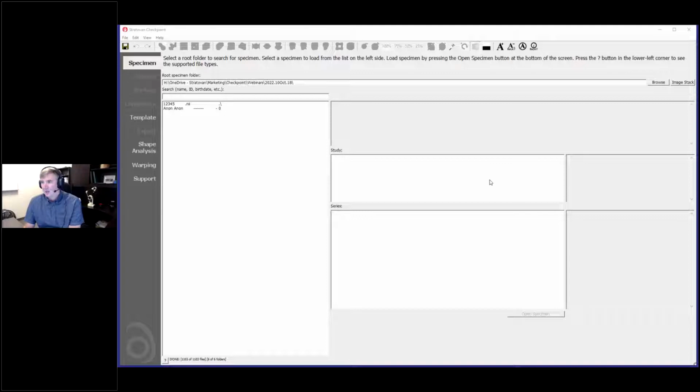So part of this webinar is to go over some of the basic capabilities of the software, how to work with different types of data, how to place points on surfaces and objects, and do the data collection that you need. Please ask questions during and interrupt if you want. I'm okay with that. We also have some basic questions that the group of you provided beforehand that we're going to try to work through. I think 2 or 3 of them allow us to cover a wide range of things.